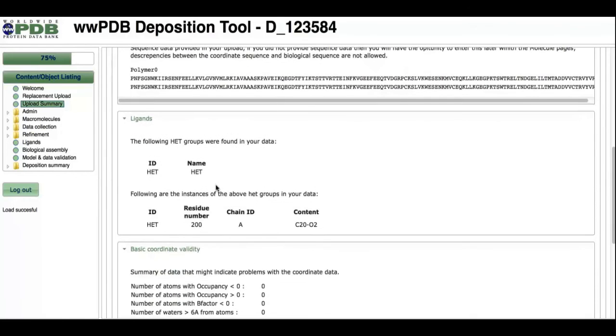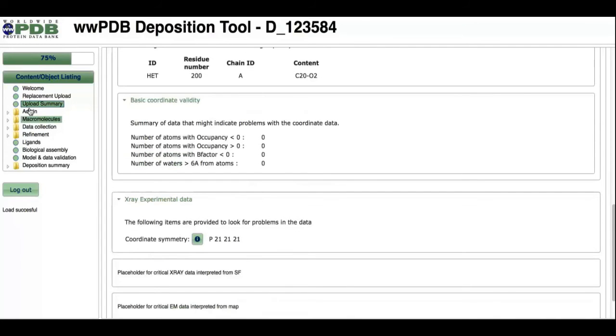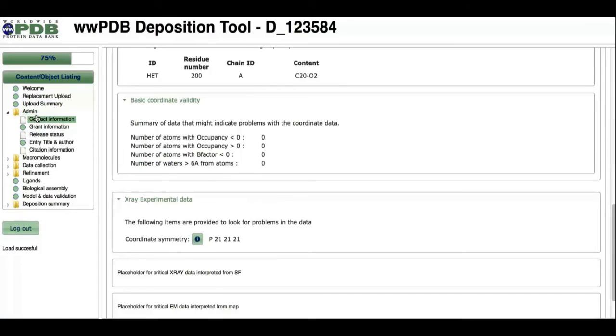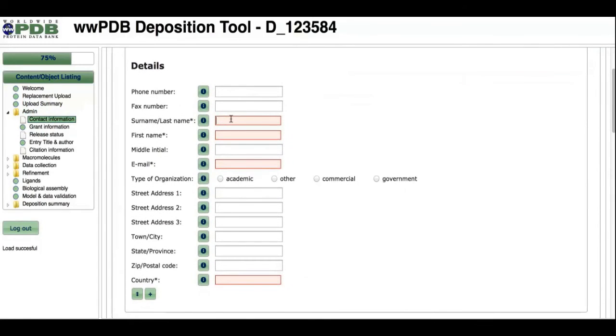Please note that the File Upload page in the left-hand menu has now become the Replacement Upload page. Use this page should it become necessary at any point to upload new files. When uploading new files, be careful to select the desired merge option.